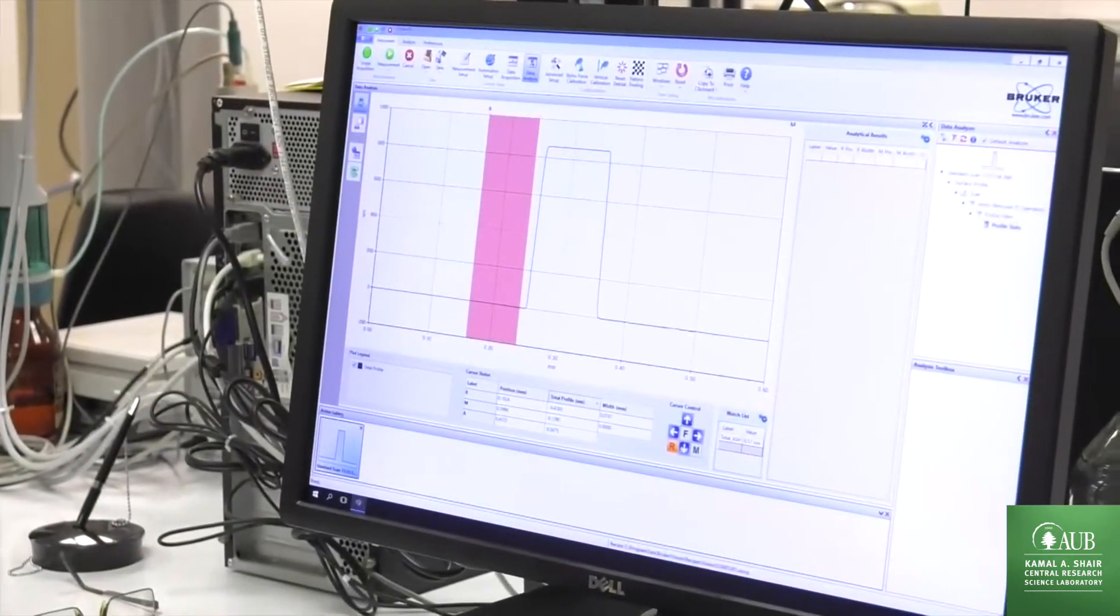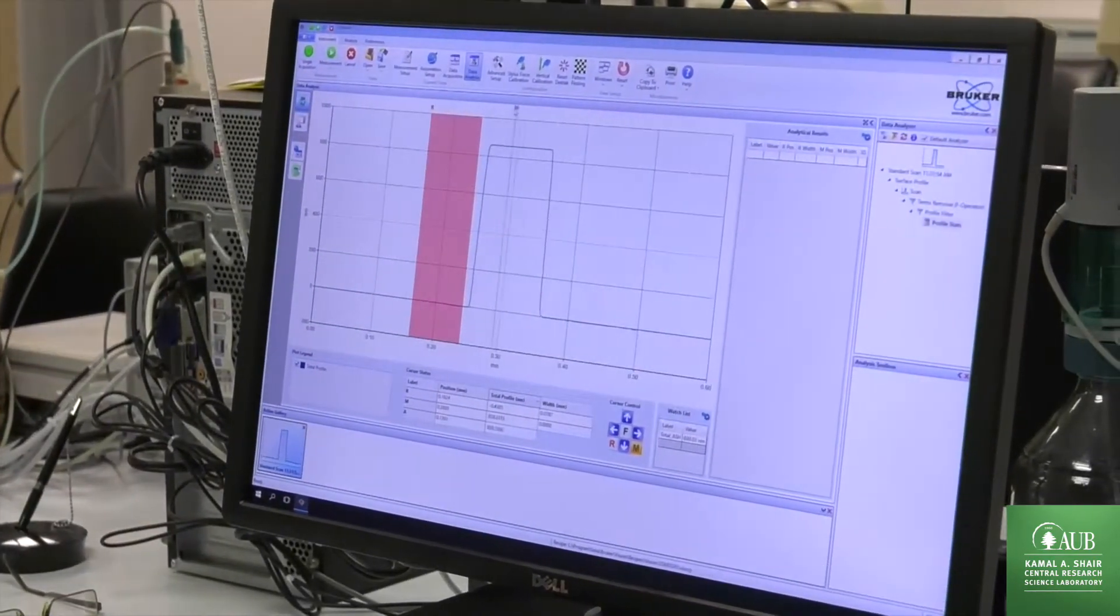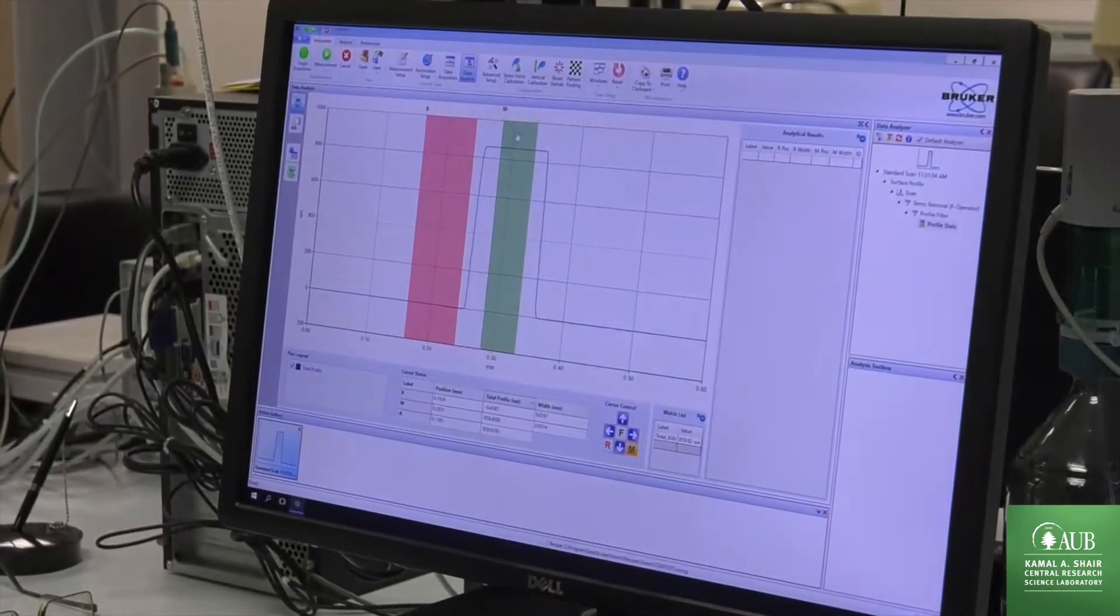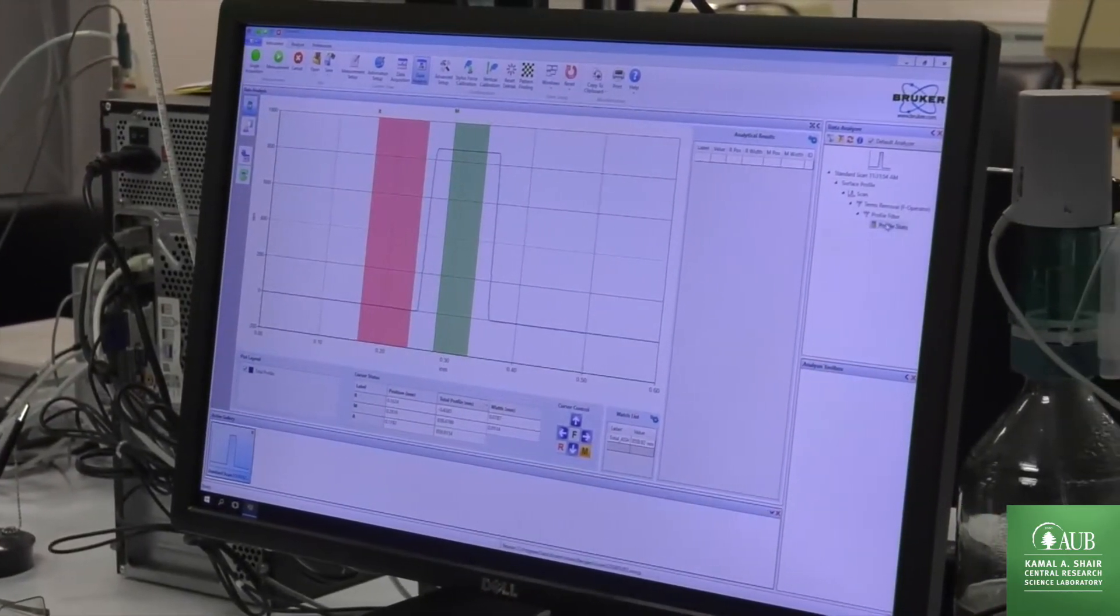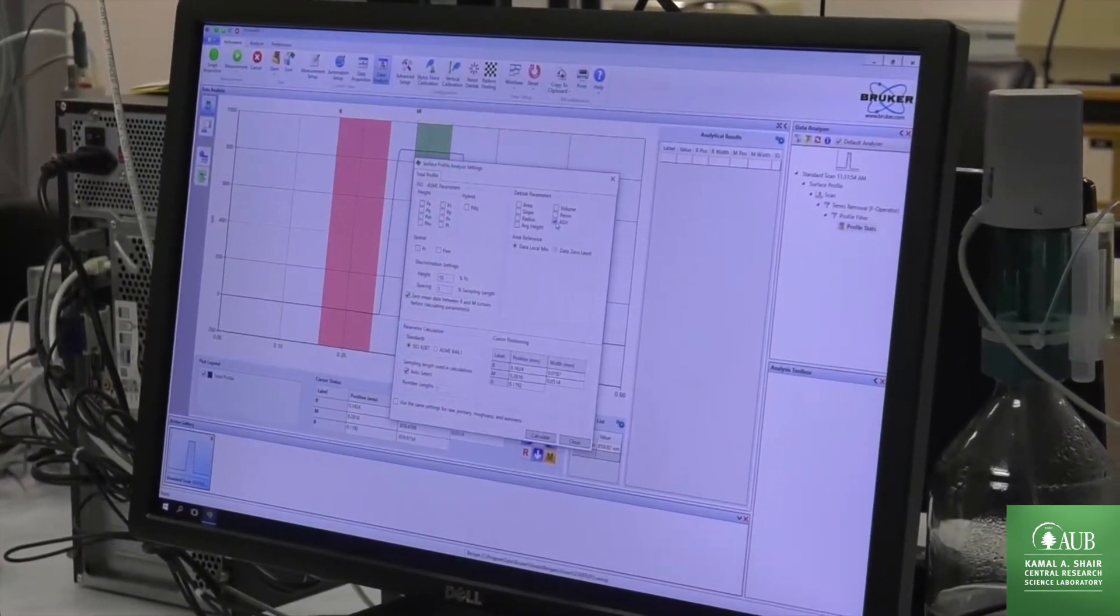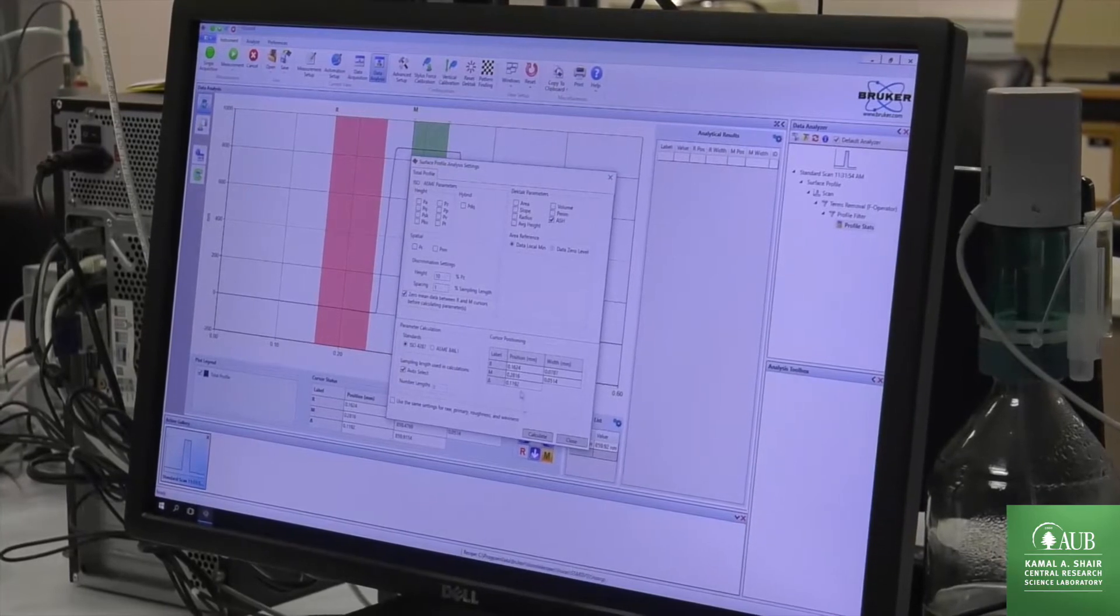We place a reference cursor on the low plateau and the measurement cursor in the center of our elevated feature and we click on edit settings and say please calculate the average step height with these cursor positions.